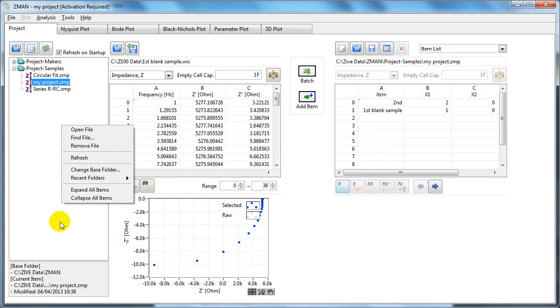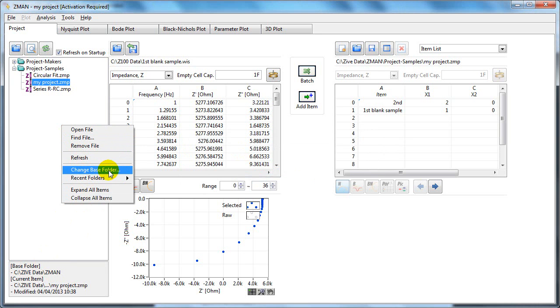You can change the base folder. So at the moment, our base folder is this CZiveDataZman. But if you want to move this to, for example, my documents, you can do that by changing the base folder.